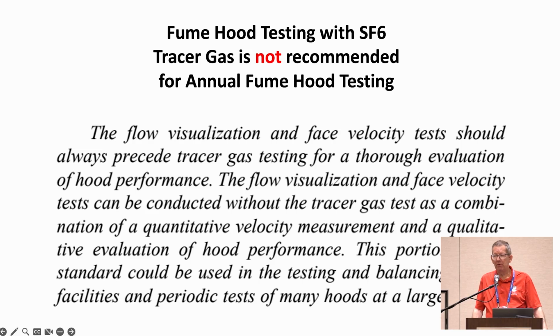So it's quite likely they're going to leave SF6 as a tracer gas, and add 2 new tracer gases. One is a gas, propane, that I have a slide up there. And the other is aerosolized liquid, isopropyl alcohol. As the guy that likes the isopropyl alcohol tells me, if my technician runs out, I send him to the grocery store to get some rubbing alcohol. What can be better than that?